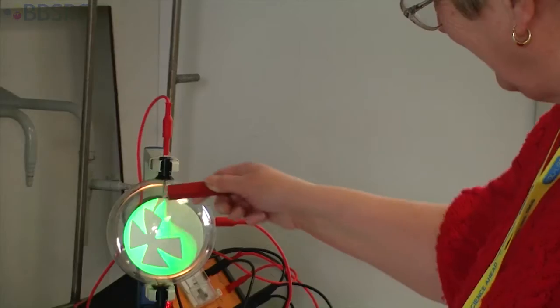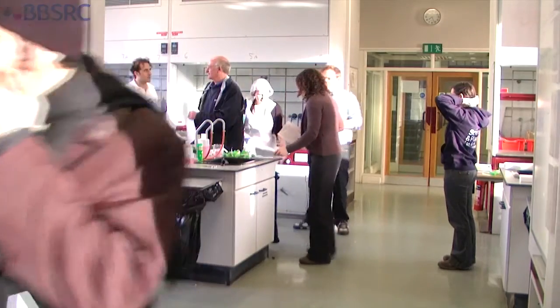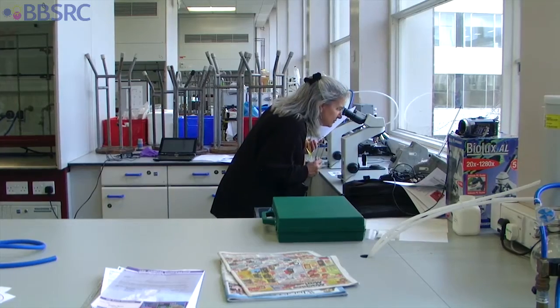Hi, we're here at the ASC 2012 conference and today we're at the Biology in the Real World practical drop-in. This is a set of drop-in practicals for teachers and science educators, held at the conference each year to support the Biology in the Real World lecture series.